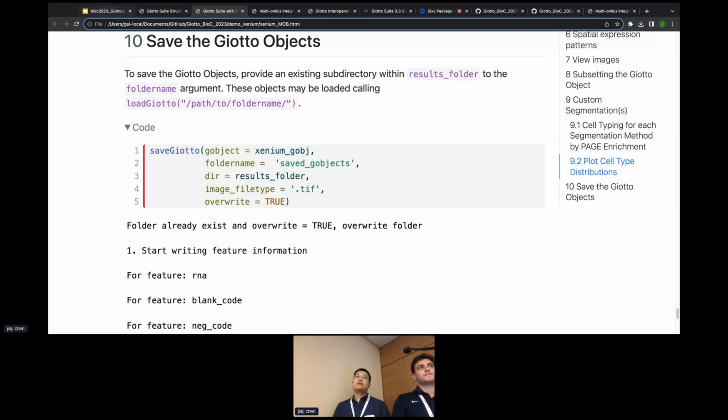Do you think it would be more interoperable with an ecosystem of existing tools like Bioconductor, SpicyR, and Zellkonverter, and the community around AnnData, so you can use Python methods? Do you think not using SingleCellExperiment would be more of a limitation?